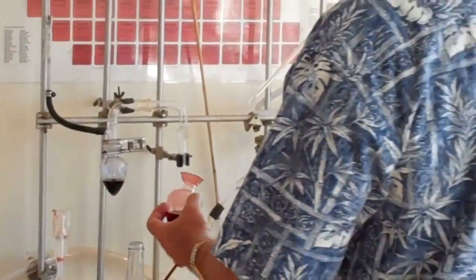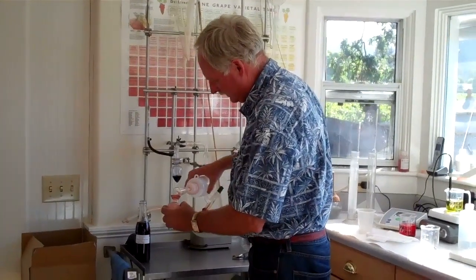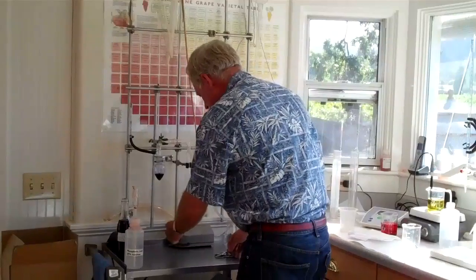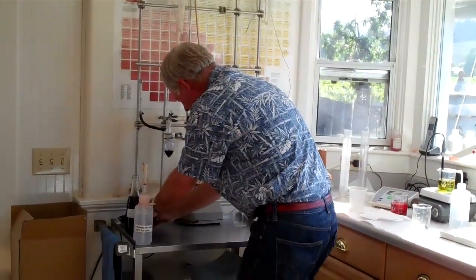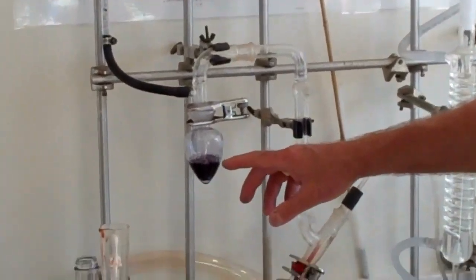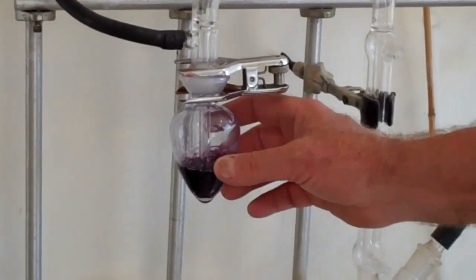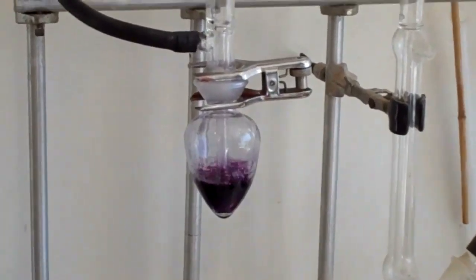Now we have our 20 ml. We add a reagent — 10 ml. This is a vacuum aspirator, and this is like the Frankenstein movies — you'll see it bubbling away. You'll notice it went from green to purple right away. We'll pull all the free SO2 into this section here and then we'll titrate it to find out how much free SO2 there is in the wine.